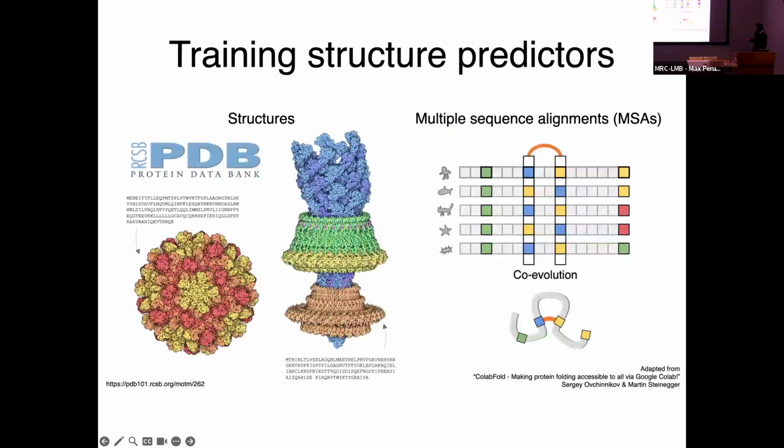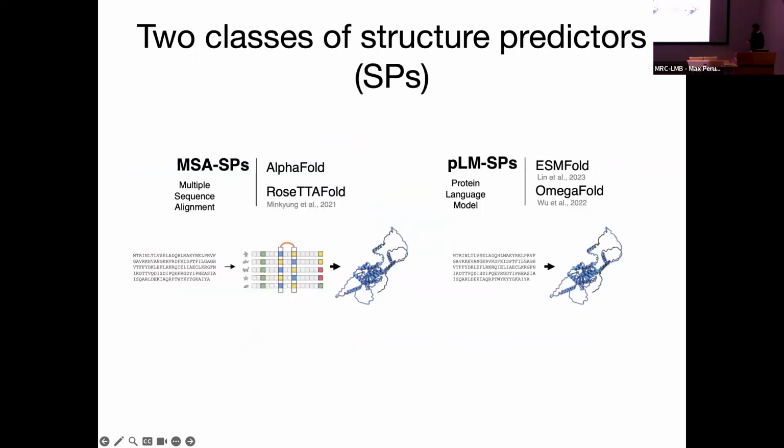So, AlphaFold. What's AlphaFold? AlphaFold is one of these new AI tools. Probably you know already, but I'm going to tell you. It's an AI tool based on a neural network which has been trained on the Protein Data Bank, which means all the structures that have been solved experimentally, either with X-ray, cryo-EM, or NMR. It also uses the co-evolution system, which takes a multiple sequence alignment from homologs and looks for residues that have been evolving at the same time. It assumes that because they've been evolving together, they must be close to each other in the structure. That's very roughly how it works.